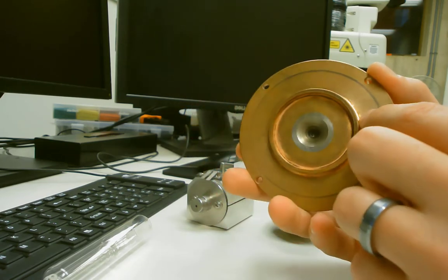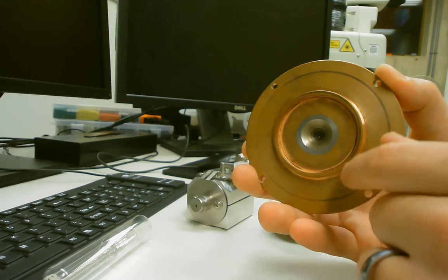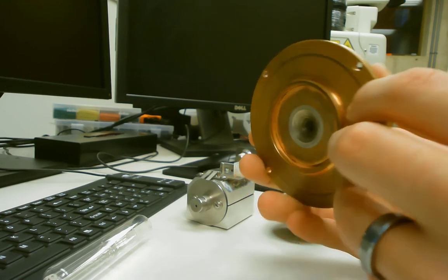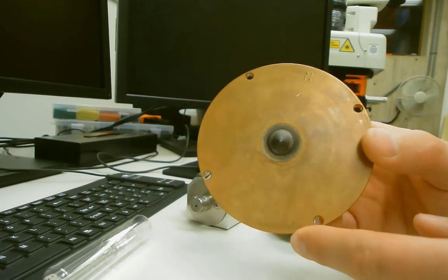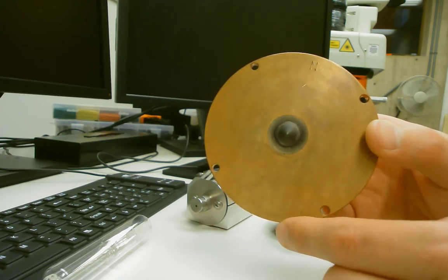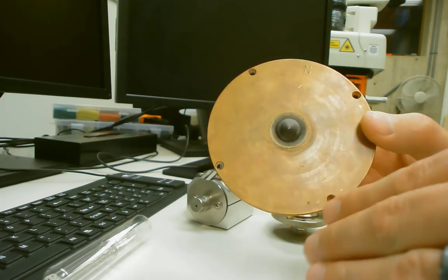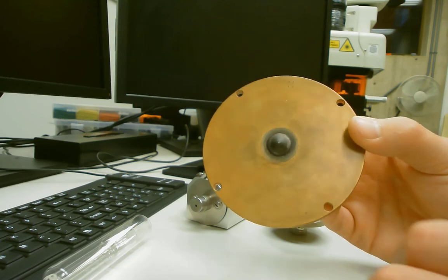The purpose of the copper plate is to keep everything cool, so this is cooled by the water chiller that I mentioned, and so the nickel won't melt under the full heat of the argon plasma. The tiny interface hole there is supposed to be 1 millimeter, and we have to make sure it stays very round and doesn't get deformed. So we don't really handle these cones unless we have to for cleaning or maintenance or changing them out.